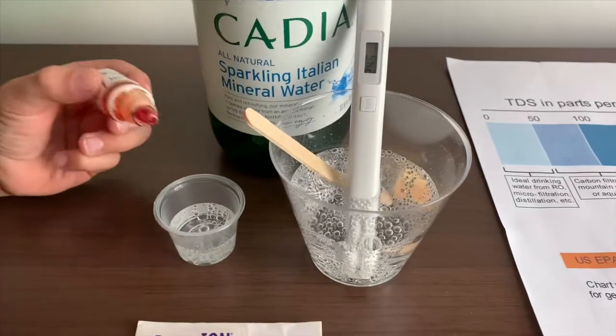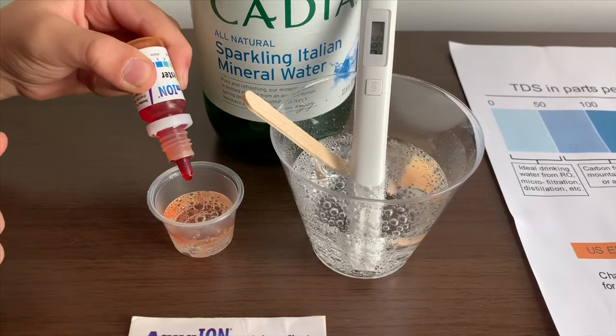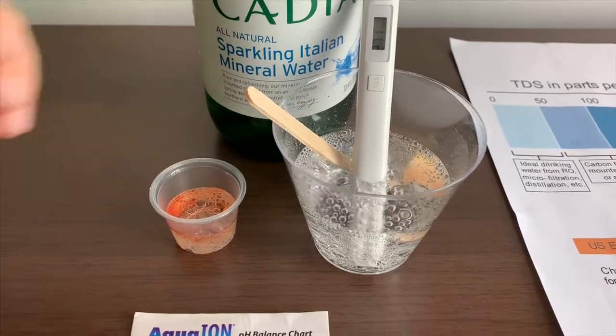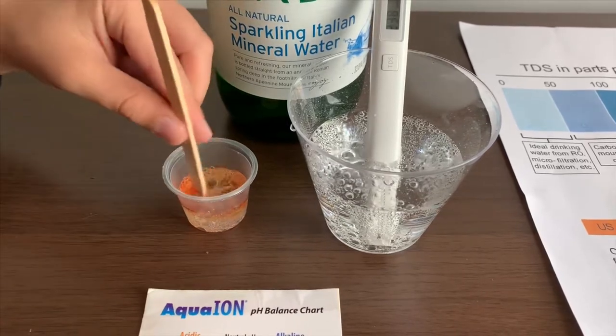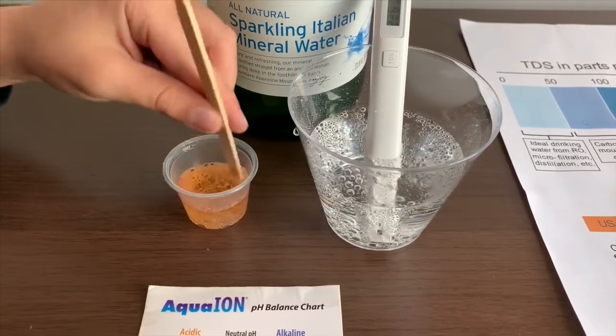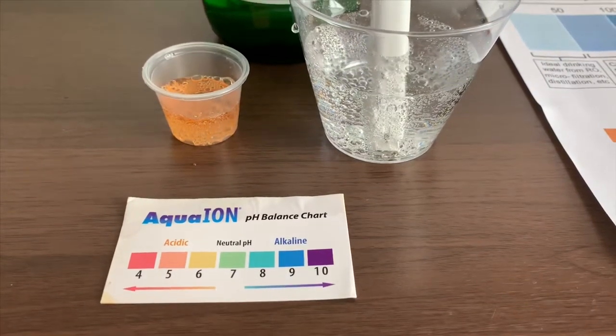Now let's test the pH level. Let me do two drops. This is 3.0 so we'll get a better result. I give this a 5.5. This is acidic.